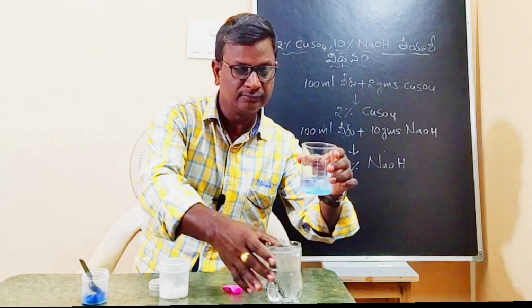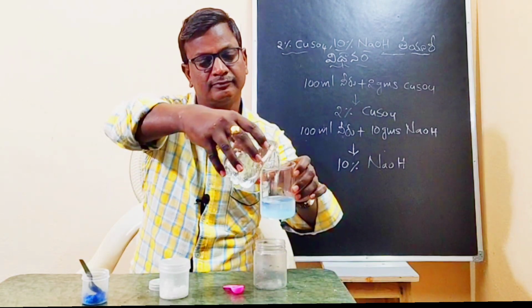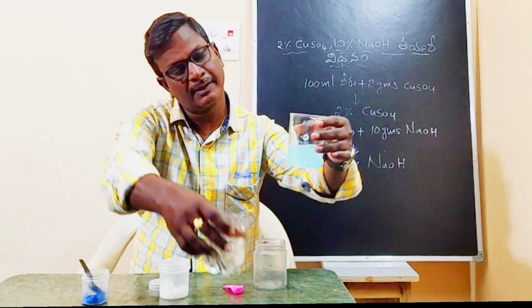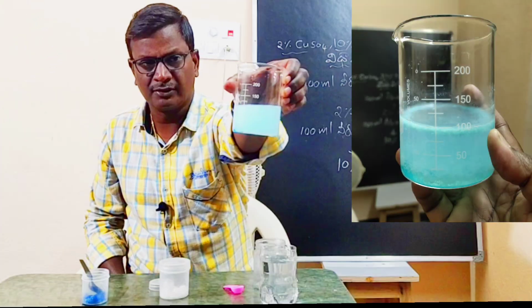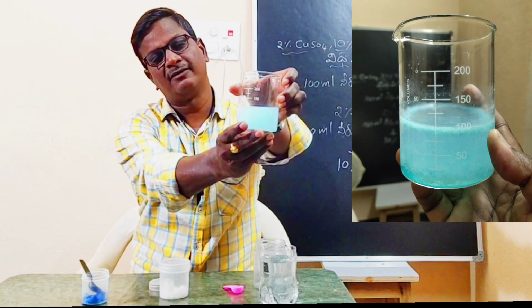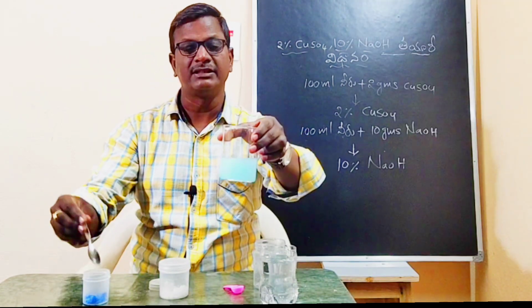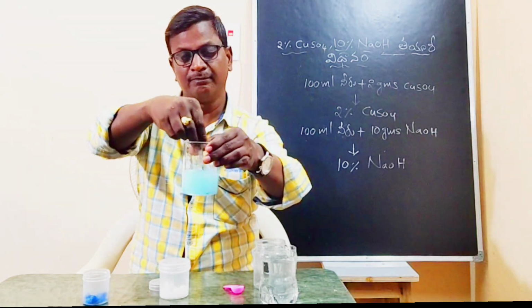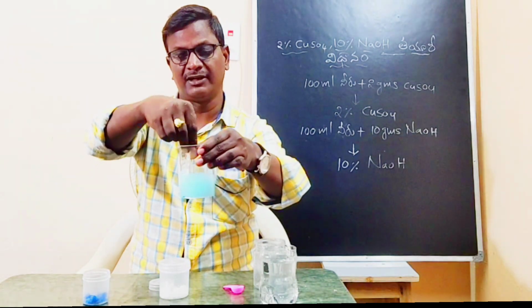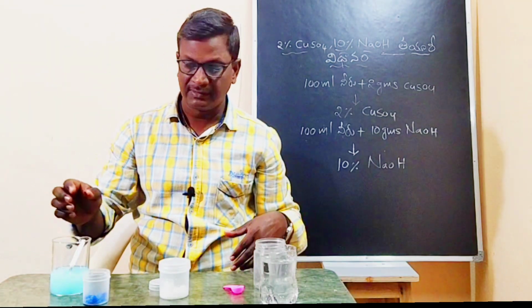I am pouring 100 ml of water. Exactly, I have taken 100 ml of water. 2 grams of copper sulphate is dissolved in 100 ml of water. This gives 2% copper sulphate. After stirring well, 2% copper sulphate solution is prepared. This is the 2% copper sulphate.